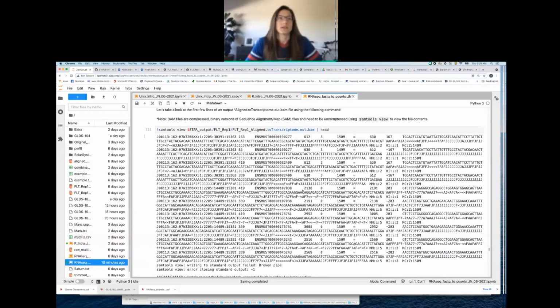As we took a look yesterday, we noticed that there are 5 unique transcripts based on the unique transcript IDs in column 3. Then we looked at how many reads were represented, and as Felix astutely pointed out, there are actually only 2 read pairs represented, as you can see by the sequence of one of the mates of the mate pair here, the other mate here, and then those same sequences duplicated for the next transcript, which means that they align to both.